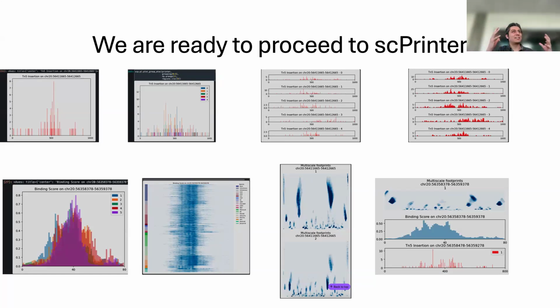It's more of a spatial perspective almost. Is it like a score that they do? Kind of. Also, please take all this with a giant grain of salt. Please read the paper. My understanding of these might not be perfect. They are very cool plots, and I do think there's a lot to learn from these, but I don't have a perfect understanding of them.